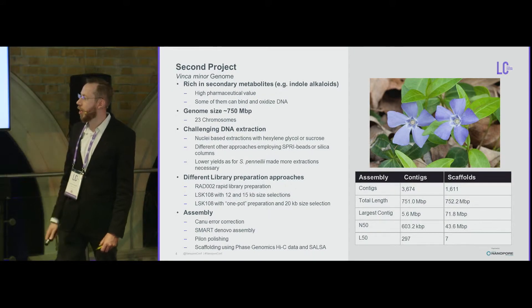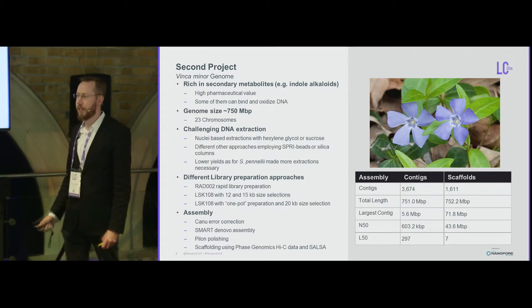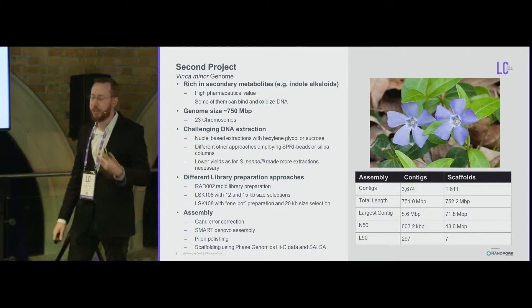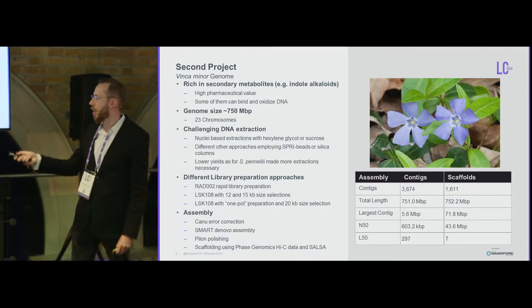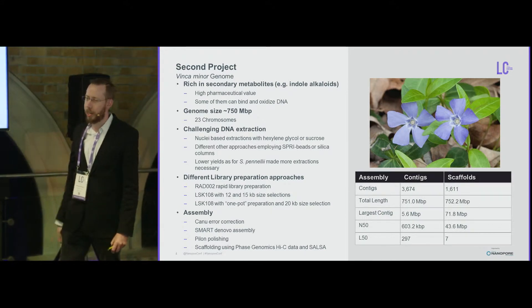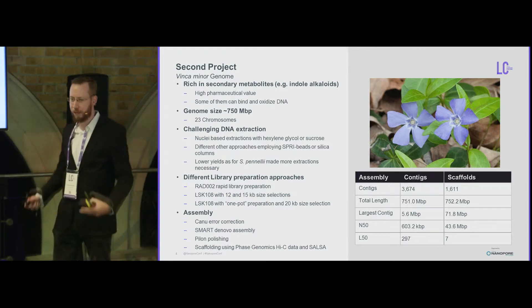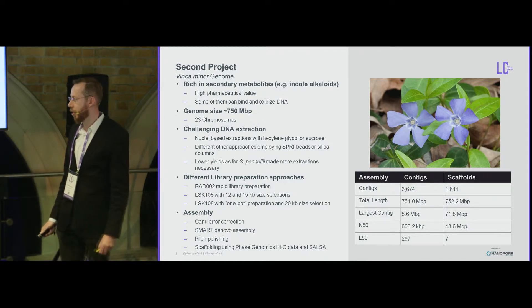We also tried different library approaches, including the rapid ultra-long sequencing protocol, which didn't work well because plant DNA is already more damaged than human DNA due to the mechanical force required to break the plant cell wall during extraction — giving only about 20k reads. What worked best was a similar approach to pennellii: a one-pot preparation combining end-repair, A-tailing, and ligation in one step, with 20 kb size selection, though it gave lower total yield because you can't remove all enzymes in a single cleanup.